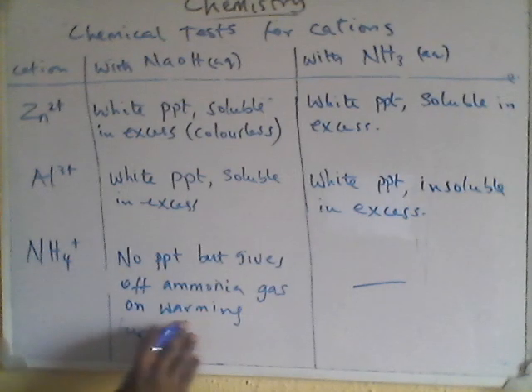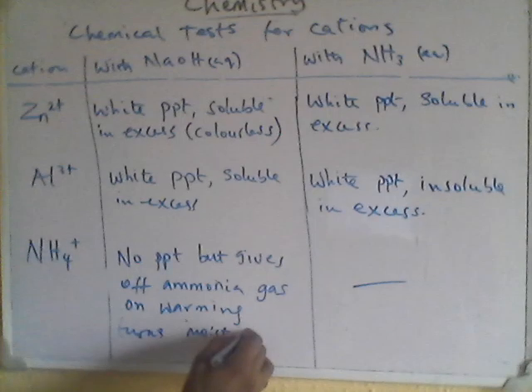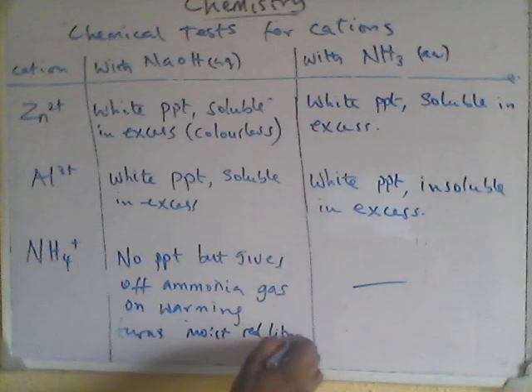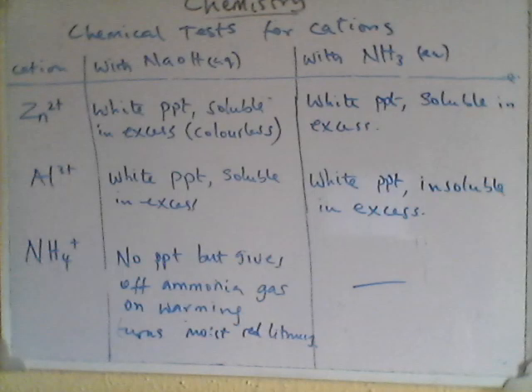Sorry, it turns moist red litmus to blue. All right. Okay, so this is the chemical test for cations. So let us go and discuss the chemical test for ions.